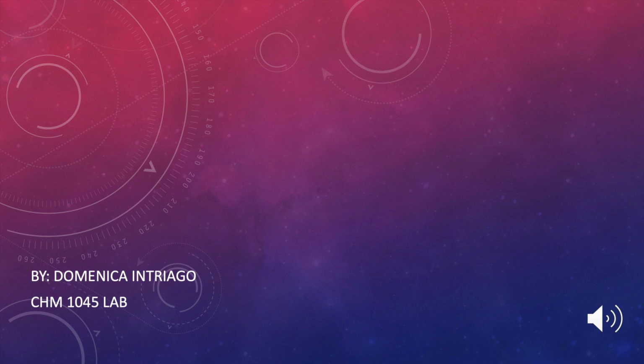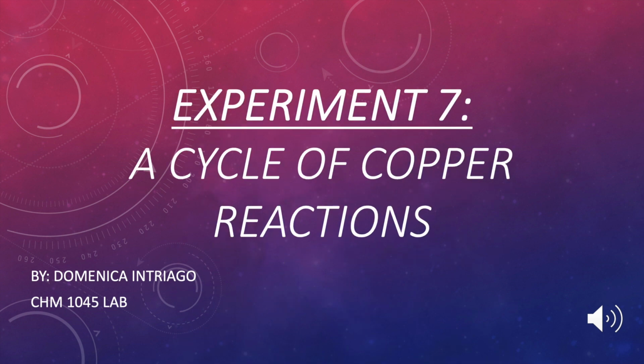I'm a part of Dr. G's Chemistry 1 laboratory class, and today I'm going to be talking about Experiment 7, a cycle of copper reactions.